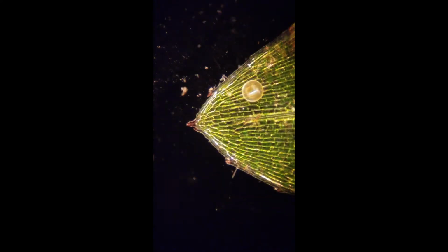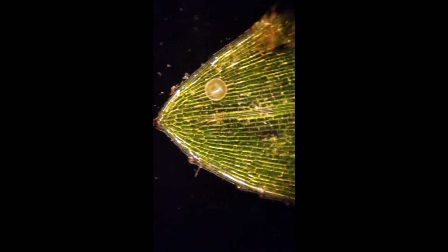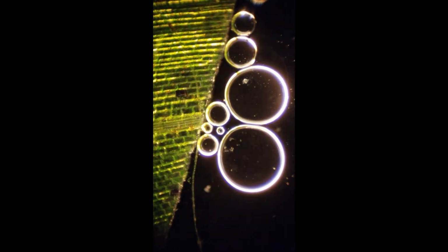And finally, my favorite, Darkfield, where we have a black background and the lighting comes in mostly from the side. Here's the leaf again at 10 times objective. Let's move all the way over to where I cut it. And those bubbles look great under Darkfield. Let's move in for a closer look.